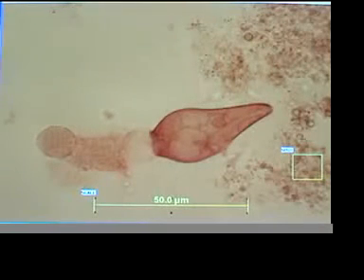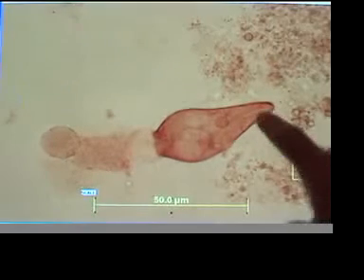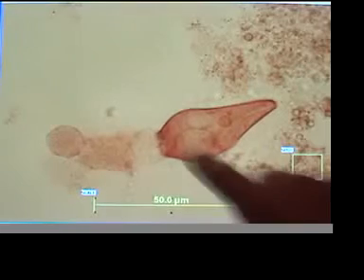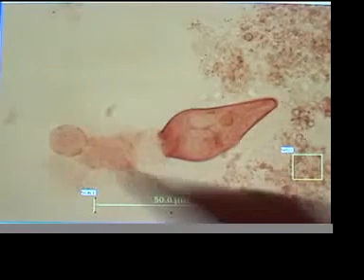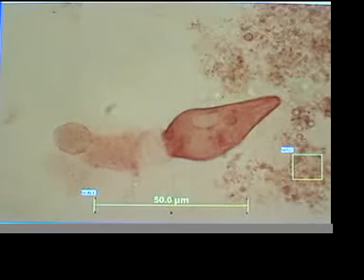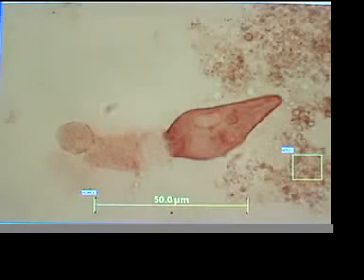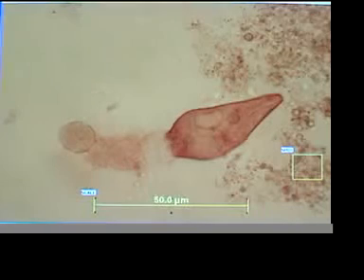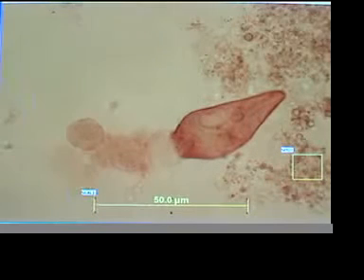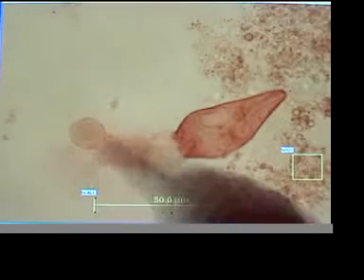I'm a little confused as to what we're seeing. I see cilia action from this Blepharisma, but he looks like he's partially devitalized or reorganized, and he was maybe hooked to another one. Now, some of the organisms were actually connected in a V shape, a kind of a mating formation, and maybe this is what the situation was, because this looks like too much material.